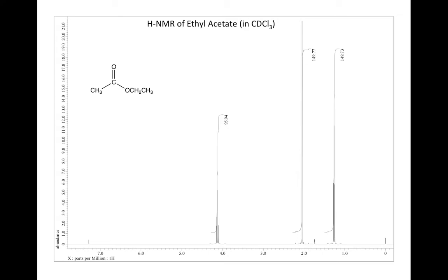Just to get us oriented, there are a number of peaks in the spectrum. You can see there's a peak right here at around 2 ppm and one up around 4 ppm. There are also some very small peaks, and I wanted to point those out before we started because you'll sometimes run into those and students sometimes get confused about what they are.